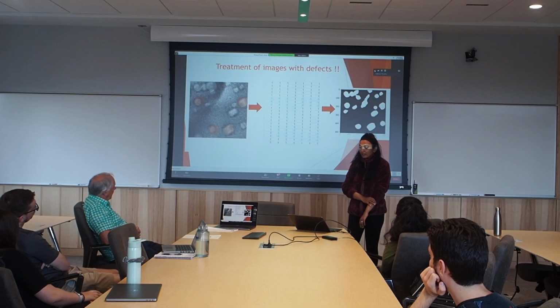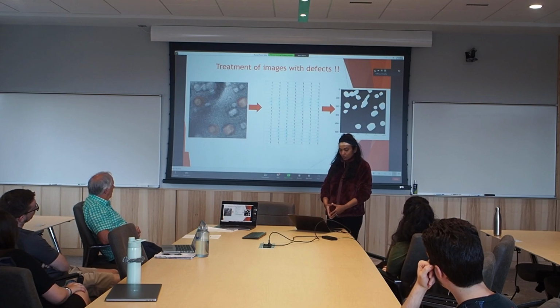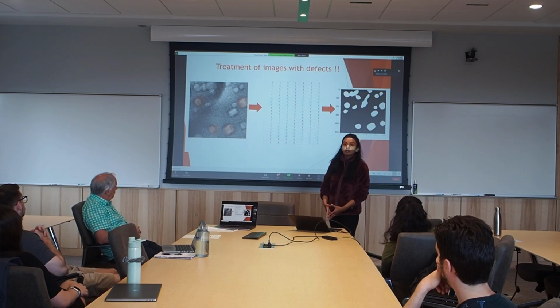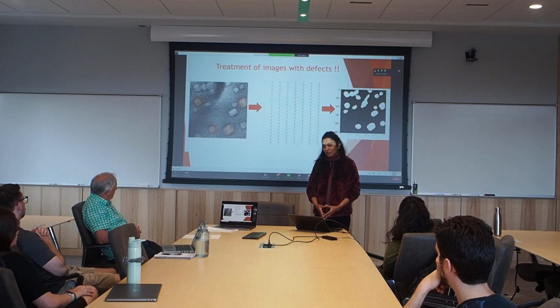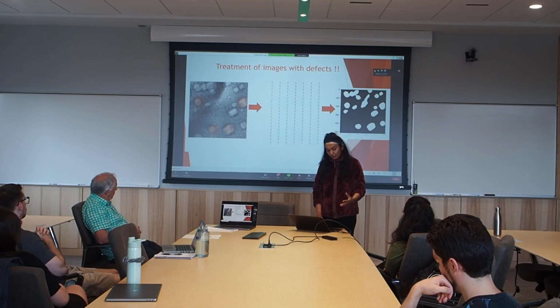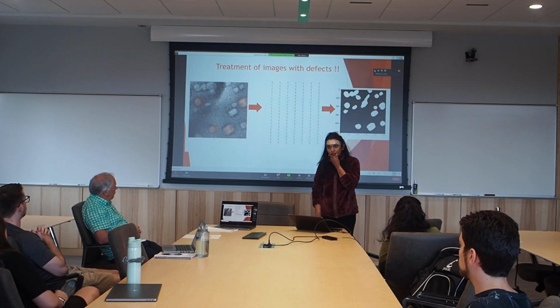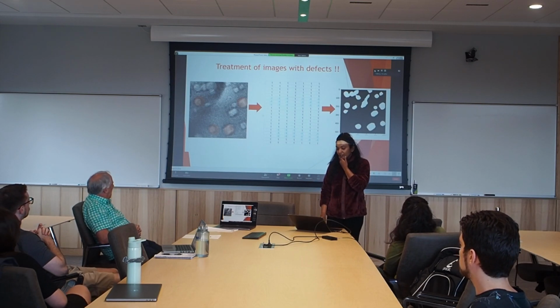Now, this is what we did. This was our image, which consists of your voids here, as you see. I will go through this in our TEM class as well: whenever it's a polygon shape, we never call it a bubble. It has to have a pressure which is equal to the surface tension. All of these here are voids, and a lot of images are marked by Sydney, a lot of images are marked by Julie, because we train our network. We have to give it initial training images, and then it gives us the final answer.